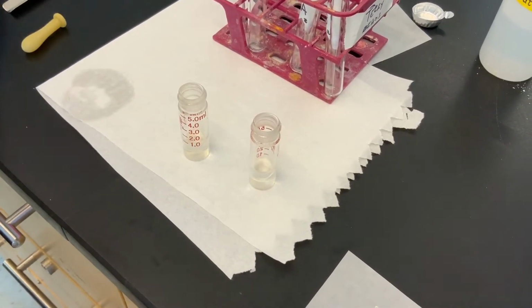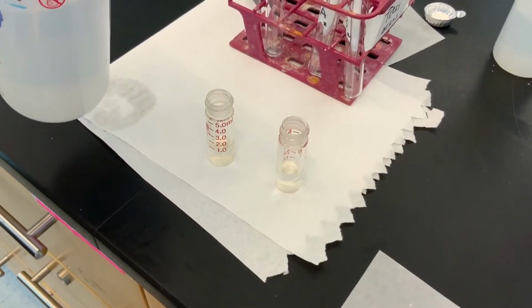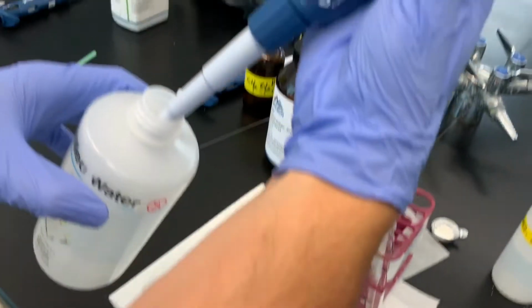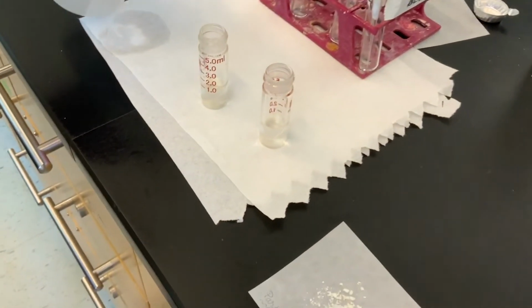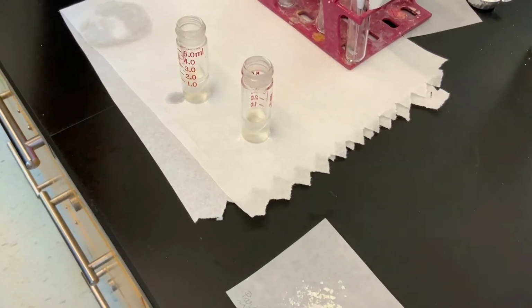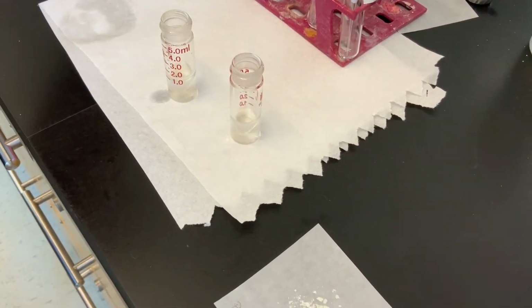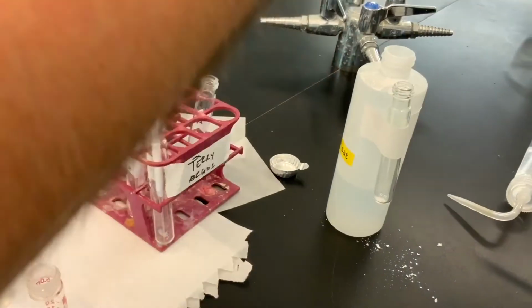So what we're gonna do, we added the methylene chloride for part A. Now, let me double check again. Yes, 600 microliters of deionized water. And then for part B, let's try and not knock it over, the sodium bicarbonate.